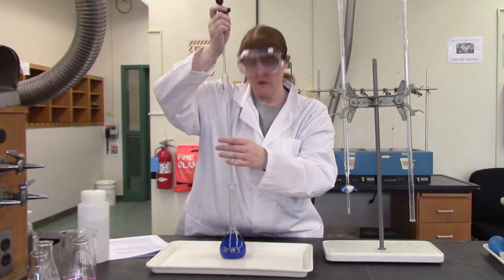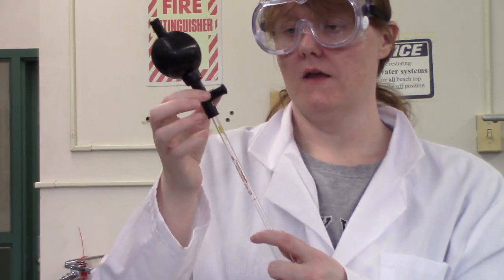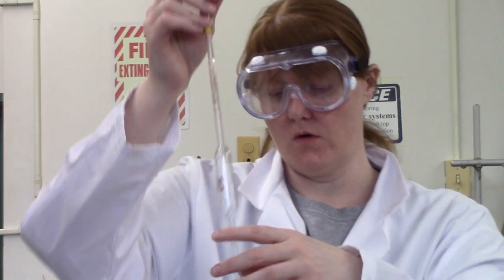Okay, so the other kind of bulb does attach to this. You just wiggle it on there. And within each one of these little spaces that have a button is a little metal bearing. All you have to do is squeeze it so that it will open around the bearing. Same thing here, I'm not pushing it all the way against the bottom.